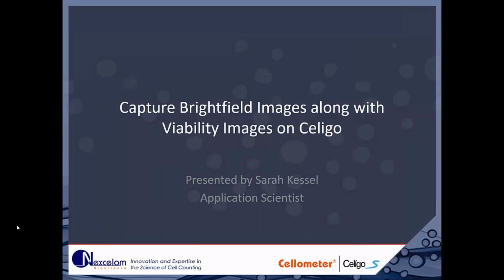But say you had a cytosolic or membrane-bound stain, then you could do a dilation of the graphic overlay in the Analyze tab. Or alternatively, you could use something like the merge application. I didn't cover that today, but that was another option in the expression analysis suite that allows you to get a little bit more pixel information beyond the nuclei area that was identified from the nucleus.